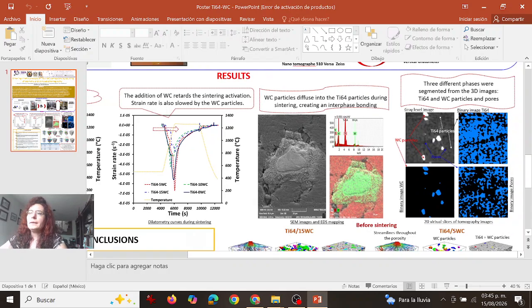with the SEM images. So the images you obtain from the electron microscope. From this electron microscope, we can obtain this type of images, and in here is the EDS mapping. EDS mapping helps us see what are the components in our sample. So we can see we have the tungsten, we have the titanium. The tungsten is in green and titanium in red.